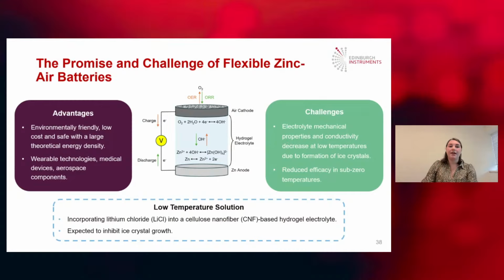This study is based on flexible zinc-air batteries. These are low-cost, safe, environmentally friendly batteries, which have a large theoretical energy density. They're of particular interest for applications such as wearable technologies, medical devices, and aerospace components.